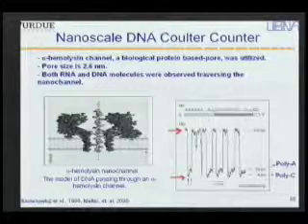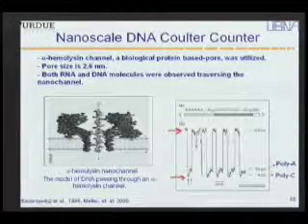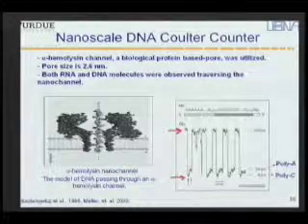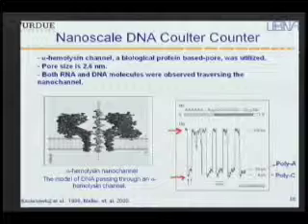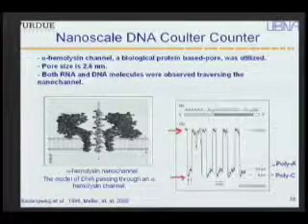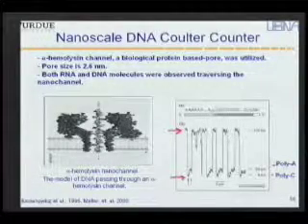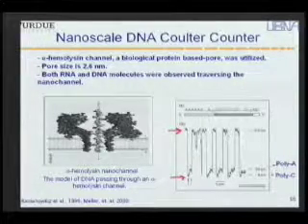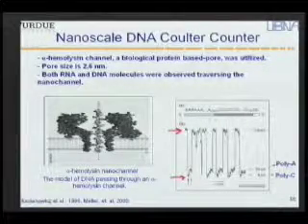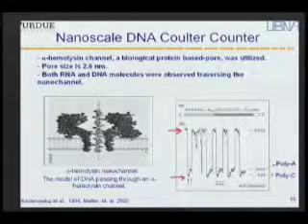So that indicates that there is a potential in this approach to maybe someday sequence a single molecule directly, base by base. And that's really the holy grail for these type of devices, where the goal is that you can take a single molecule, pass it through a sensor like one of these pores with maybe some other sensors on the surface, and detect the passage of single bases as they're going by, and hence directly sequence a single molecule.